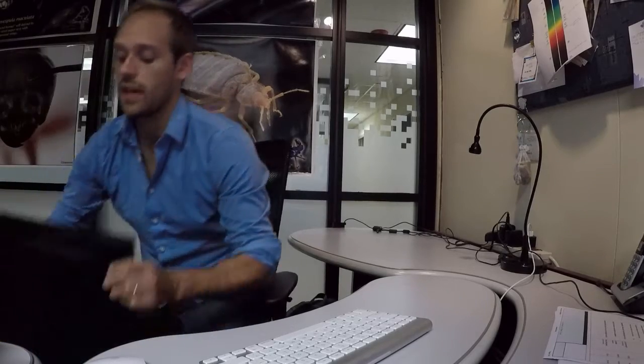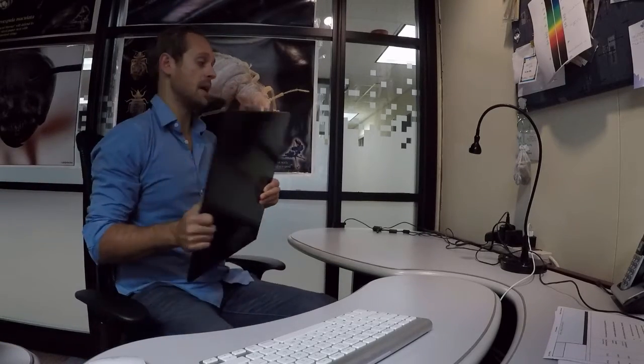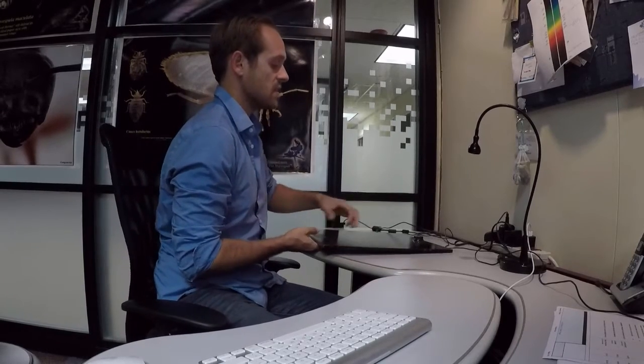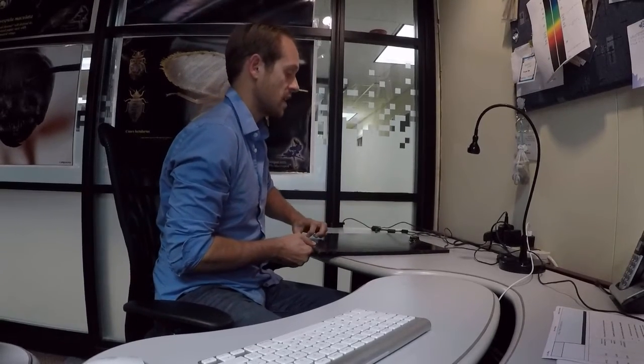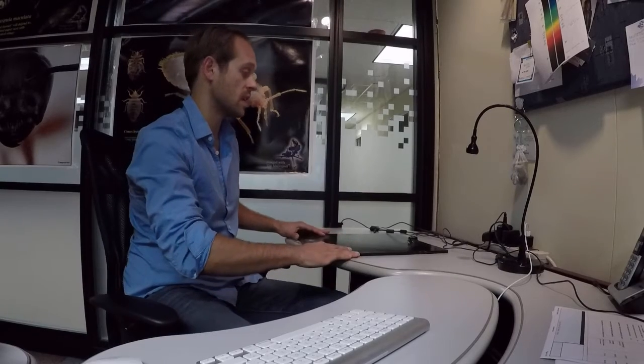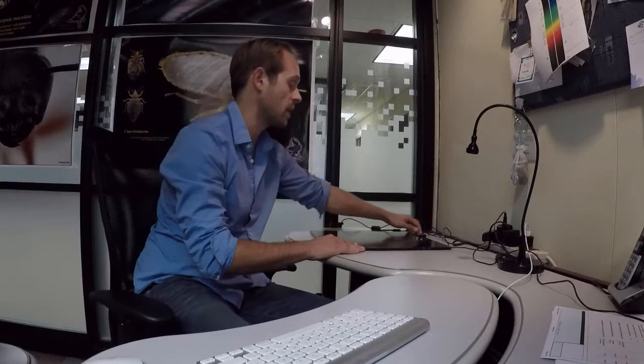With the vertical stand, we have this heavy iron base. It's heavy for one reason: copy stands and any other vertical setups carry a lot of vibration, so we want something really heavy and sturdy to cut down on that vibration whenever we're focus stacking through an object pointing down.